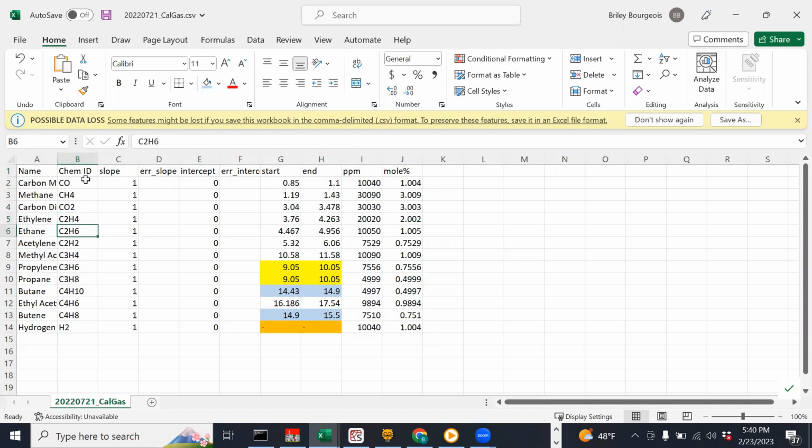it's going to throw an error on the MFC system because it doesn't recognize the gas that you're trying to flow. This is taking the top 5 or 6 gases in terms of concentration. It's mixing them together and giving that as the calibration number for the flow controller so you get accurate flows. And at this stage, it's really important to have the concentrations for each of these different gases listed with these headers.